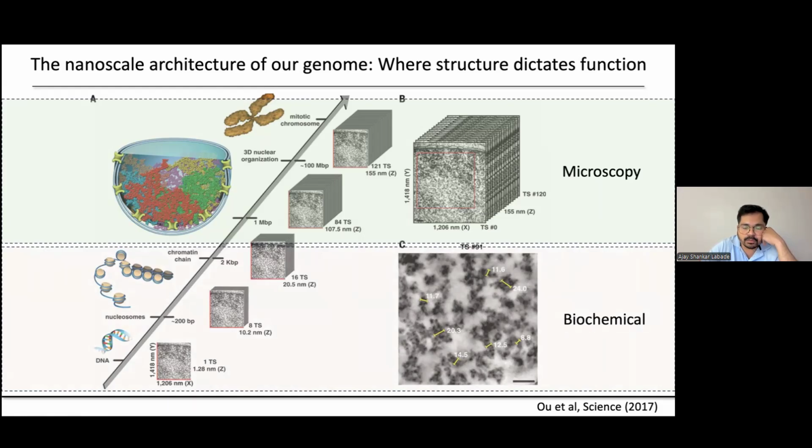That includes chromatin immunoprecipitation or chromatin conformation capture methods, where we can capture the conformation of the genome, how it's organized. But what it lacks is the spatial information, where that piece of DNA is coming from, or how that particular part of DNA is organized inside the nucleus. And therefore, we need a technique that can allow us to do both. The technique that can allow us to not just look at the DNA, but also to sequence the DNA.